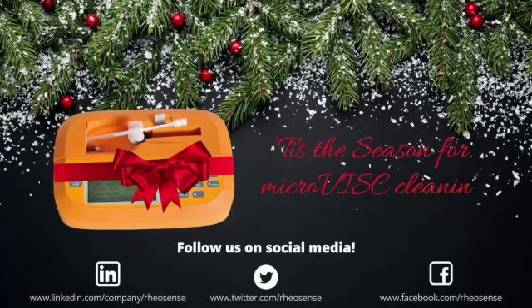So now we can go ahead and get into testing. The first thing we're going to do is make sure that we have a chip installed in the microVISC. So this is our microVISC here. This is our special red edition microVISC that we just use for our internal testing, but most of them are a lighter orange. So here's our chip. We already have a chip inserted.